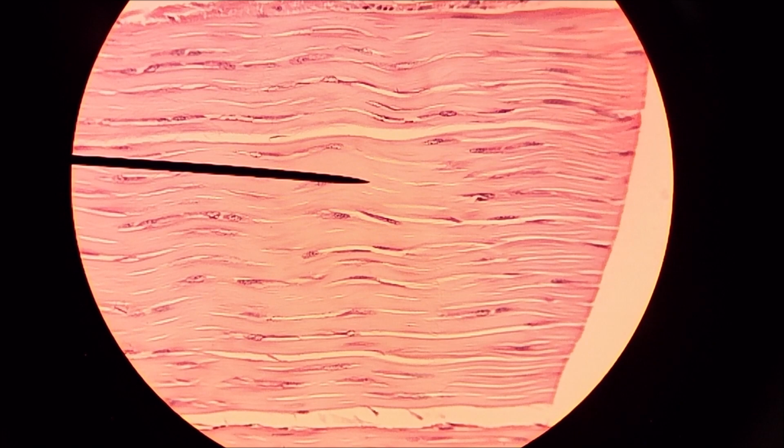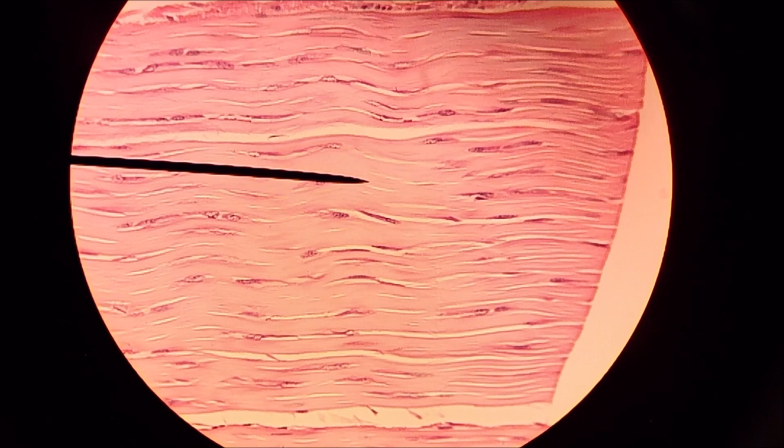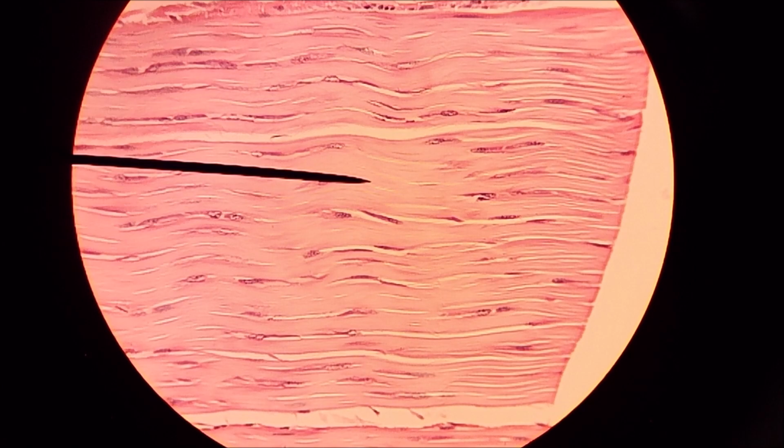All right, guys, this is dense regular connective tissue. What I want you to notice is the wavy lines in this. I can zoom it out a little bit. You can kind of see that cut edge and those wavy lines. That is classic, dense, regular connective tissue.